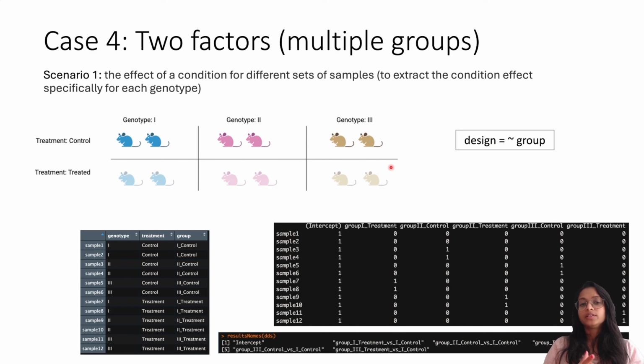So we could model the data this way. In this case, we would not need to use interaction terms because we are simply interested in the overall effect of each factor and not necessarily how the effect might interact or change depending on each other.